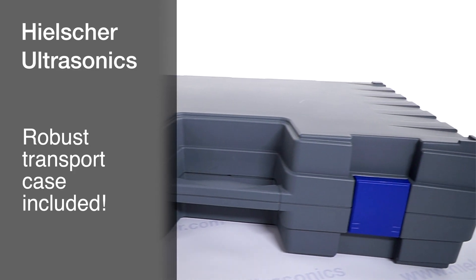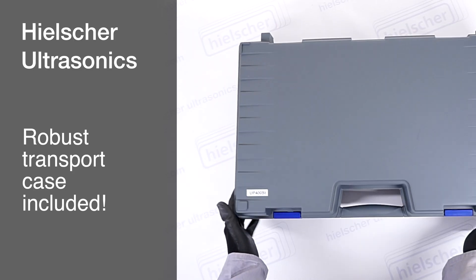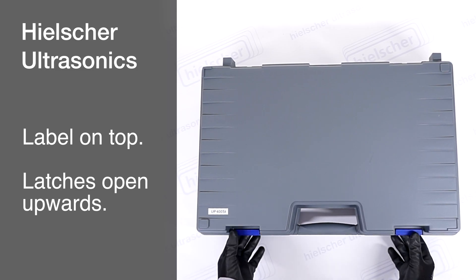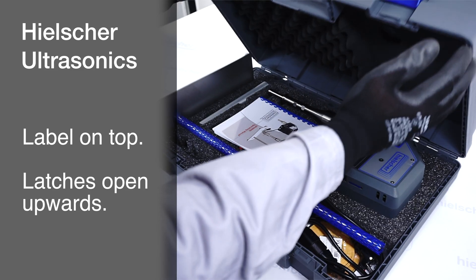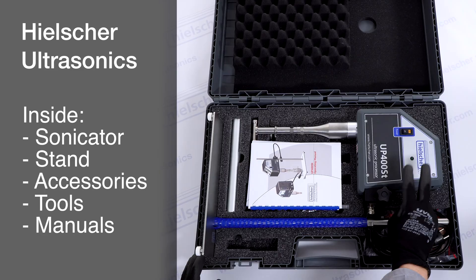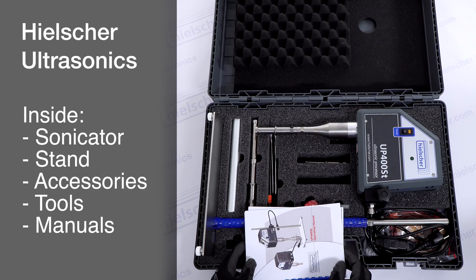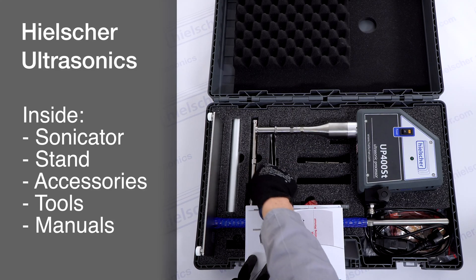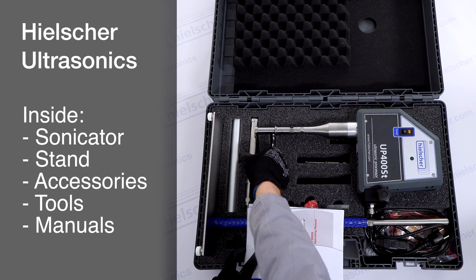The UP400ST Sonicator comes in a robust transport case. Please place the case on a table with the label facing upward. The case latches open upwards. Inside the case, you will find the Sonicator itself, the stand, various accessories and cables, tools, and the user manuals. The contents may vary depending on your specific order.